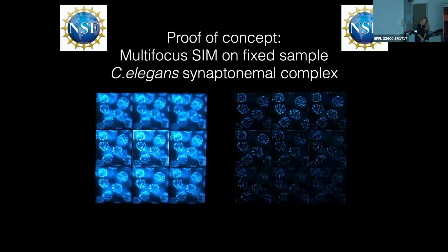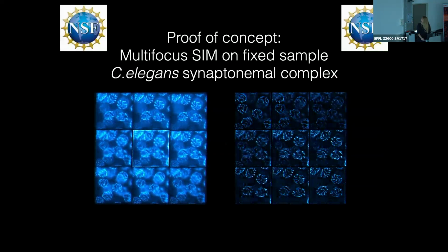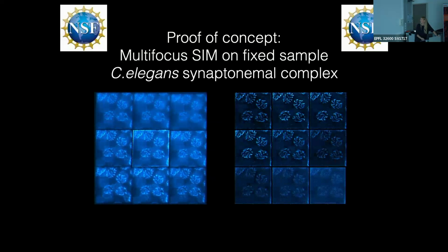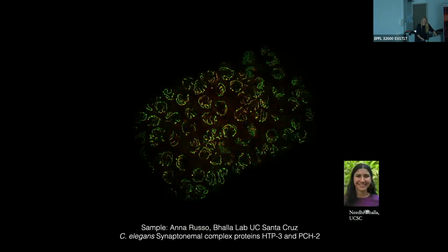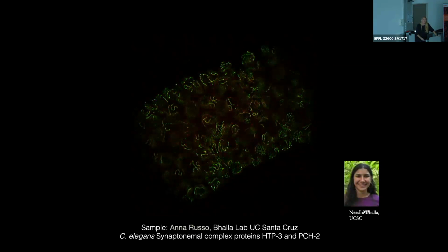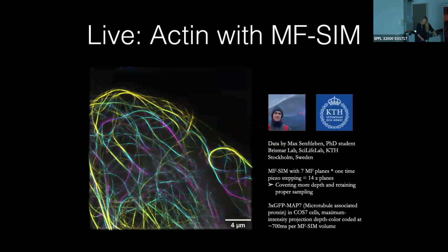And we built one of those in the imaging facility in Santa Cruz. And there's a little bit of proof of concept, synaptonemal complex imaging going on. The reconstruction becomes hard here, and Lin Shao is working with one of my students on trying to solve that. And then hopefully, if we can do that in a useful way, we'll be able to image this live. This is so far fixed samples. So that's one of the future goals of that.